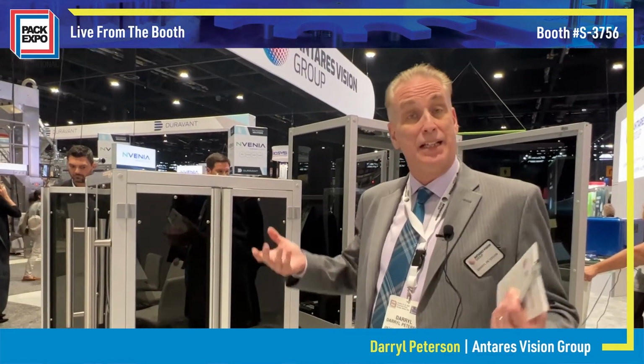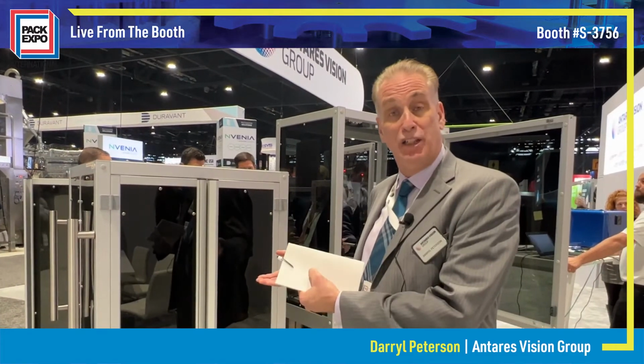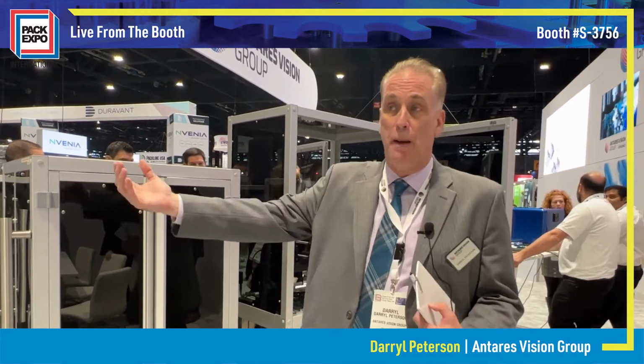But what we're seeing today is a lot of customers are interested in doing this as well at their plant, where they can do testing of products before they get them in the automated inspection machine, develop the recipes, and then download them to the machine in advance. So it helps them to actually provide a testing lab to test products in advance, so you don't have to have them sent to our company to do all that work. They can do it themselves.